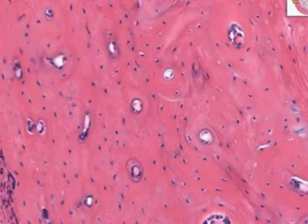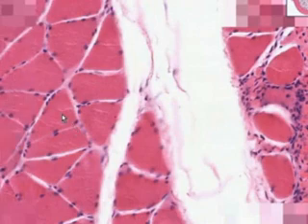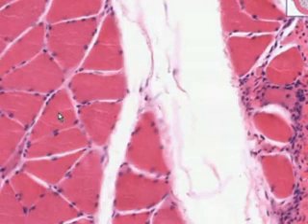Last but not least, because we are calling this shotgun histology, we've already seen the marrow. I want to show you one more little picture towards the periphery of this bone. And I think you could instantly recognize this as being skeletal muscle. You can't see the striations very well, but you can see the fact that they are big fibers and they are cut transversely with respect to their longitudinal axis, and you can see that all the nuclei are at the periphery. So boys and girls, here we have a mature cortical dense Haversian bone, and I thank you very much.